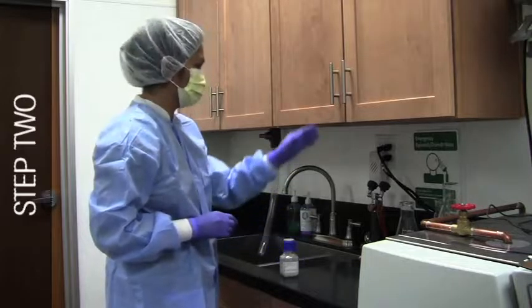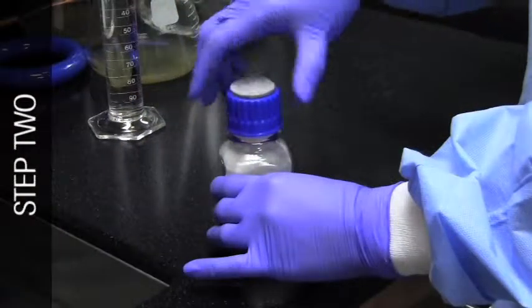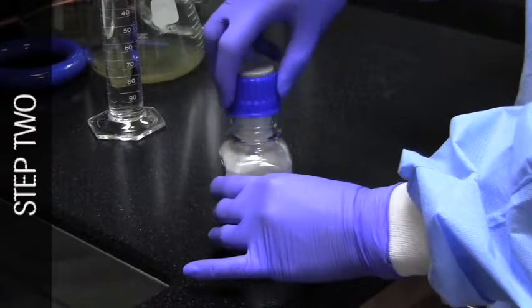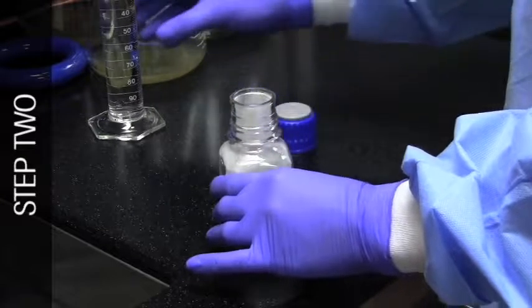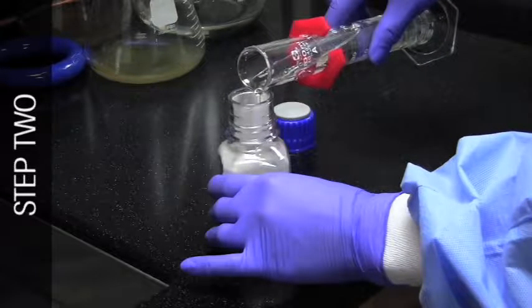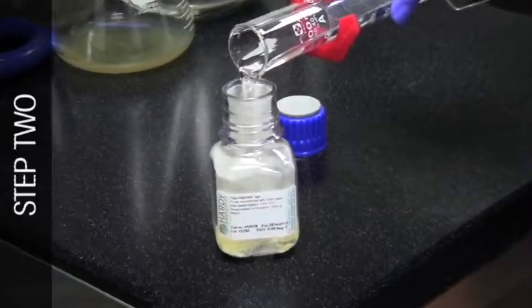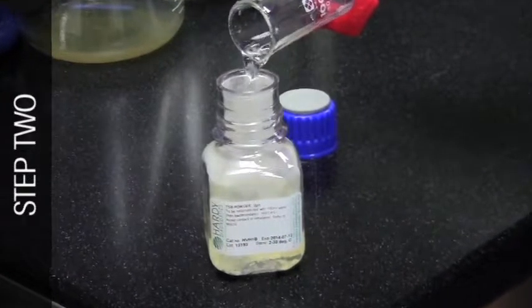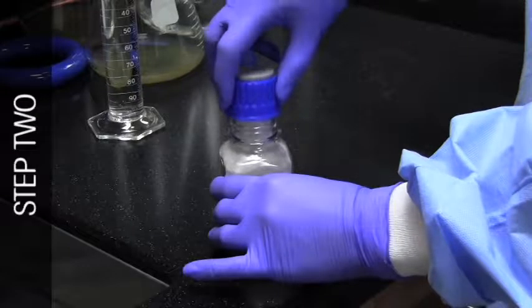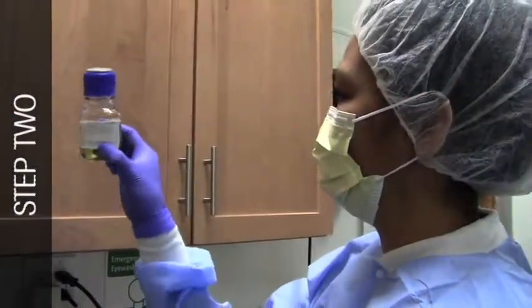In an area outside the laminar flow workbench or isolator, remove the cap from the tryptic soy broth powder bottle by unscrewing it. Using a graduated cylinder, prepare a 3% solution of non-sterile tryptic soy broth by adding 100 ml of non-bacteriostatic water to the bottle containing 3 grams of powder. Replace the cap, tighten, and invert the bottle several times to mix. Ensure that all the powder is dissolved before proceeding.